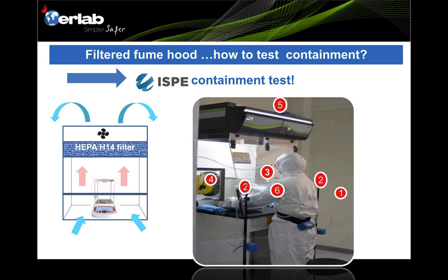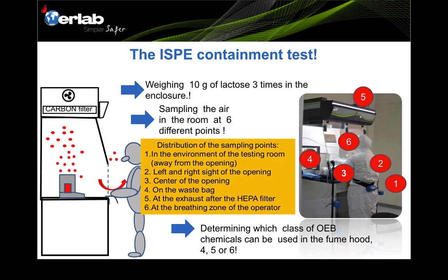To summarize, the filtered fume hood will be the preferred way to provide protection for weighing applications. According to ISPE, a proper filtered fume hood needs to go through a containment test to ensure it provides maximum protection to the user. This picture shows how the containment test is done. During the test, they basically weigh 10 grams of lactose three times in the enclosure, and air samples are collected from six different points.